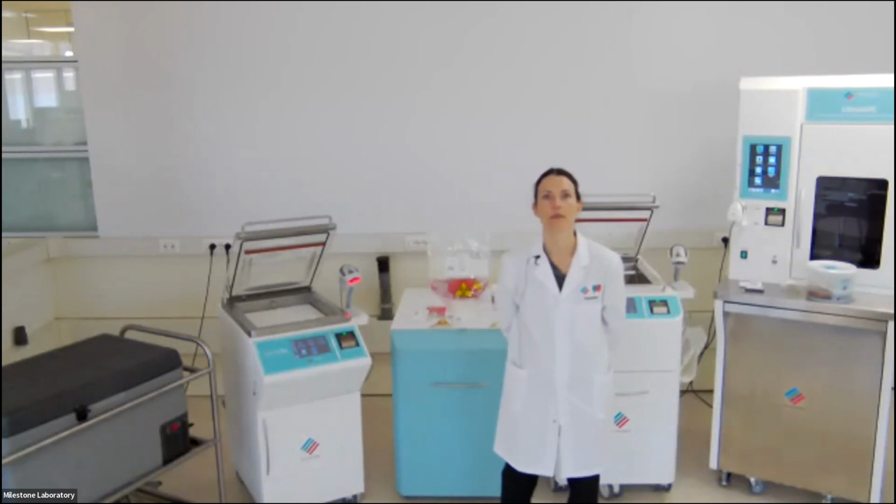Thank you. Let's move to another one. This is maybe a repetition, but let's do it. Can we use Seal Safe for sealing tissues with and without formalin?